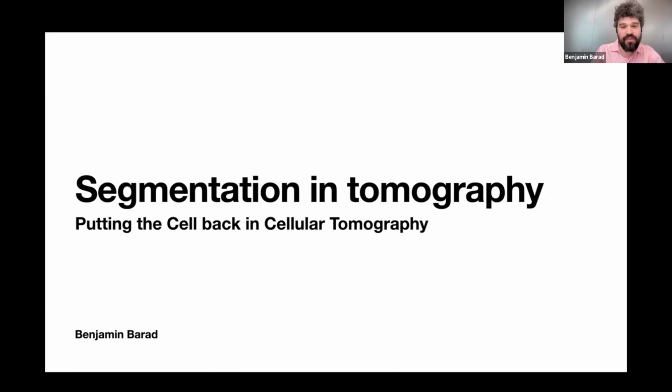But first I wanted to talk about, not how we're going to do it, but what segmentation is and why it matters. My lab at OHSU is really centered around the ways that we can creatively use segmentation to advance cell biology with tomography.